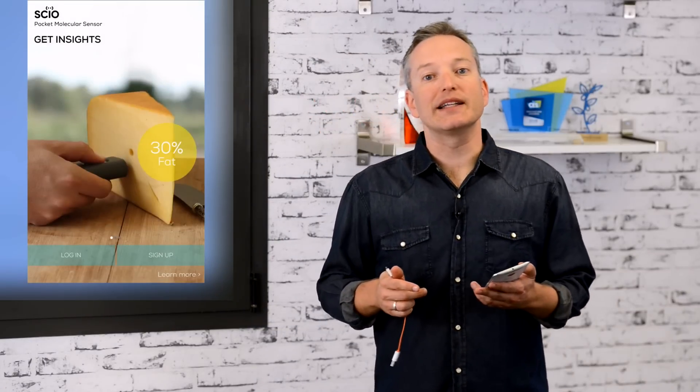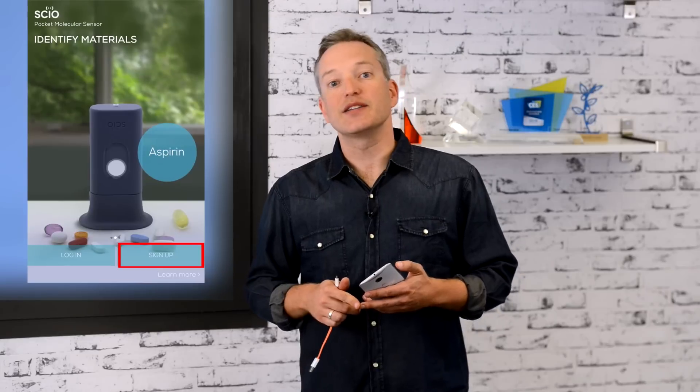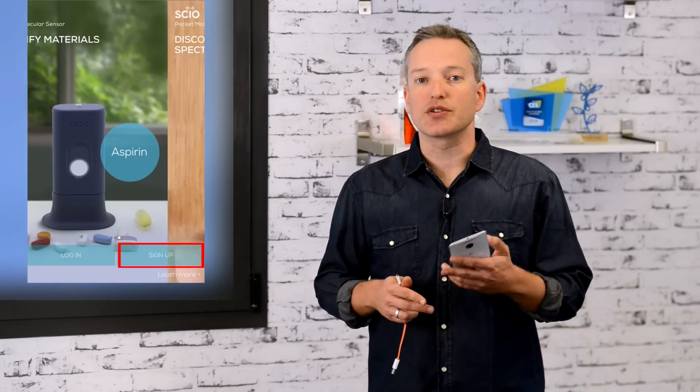So your Sayo is fully charged and you've downloaded and installed the app. Now let's launch the app. When you launch the app for the first time, you have to sign up by clicking the sign up button — unless you're a developer, in which case you can use those credentials to sign in.